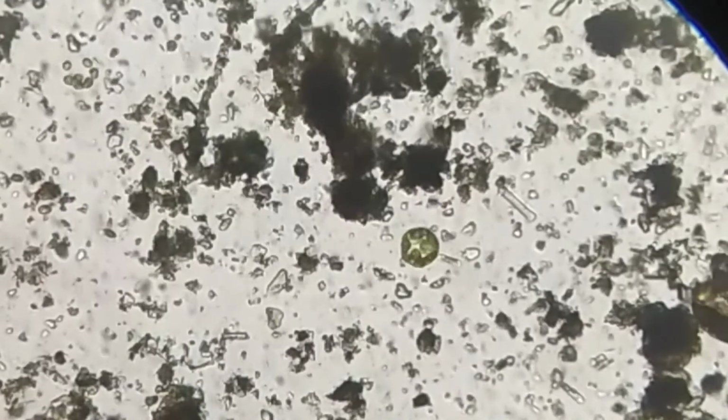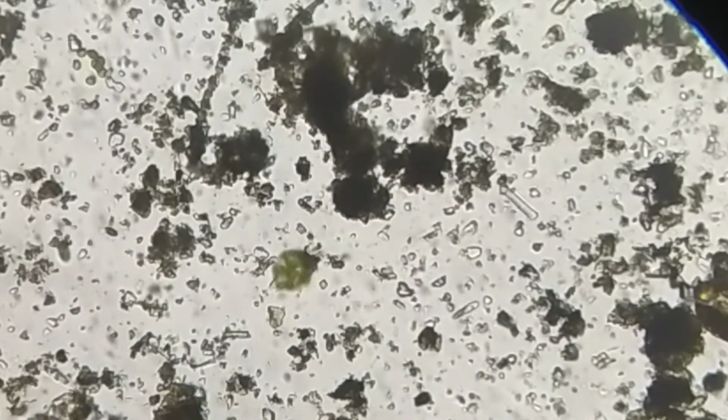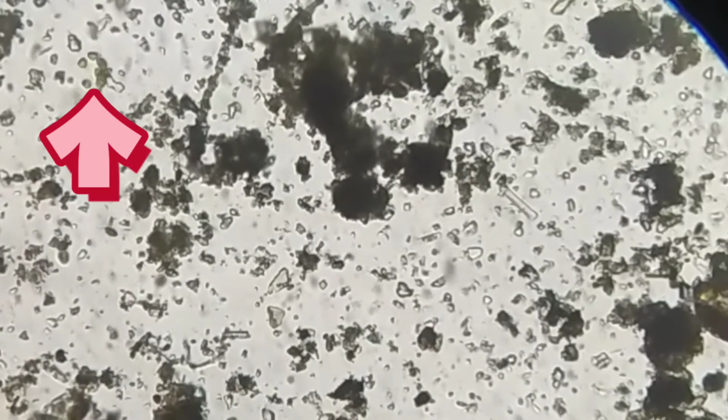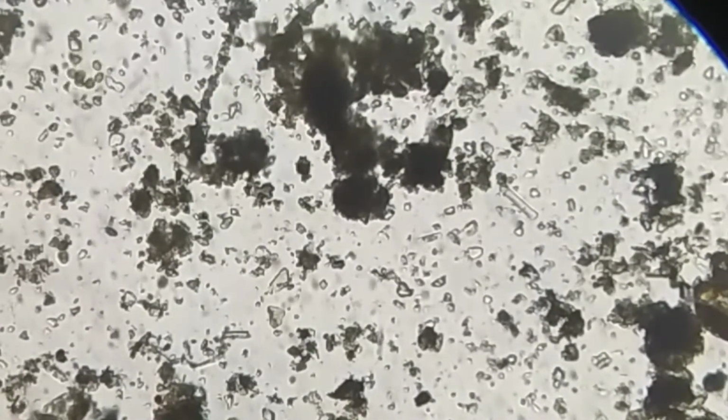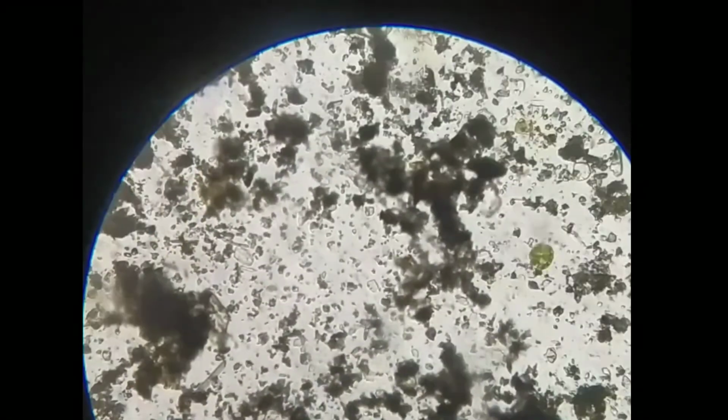So here comes our volvox. As you all can see, that novel coronavirus-like thing is actually a volvox. It's a green algae, and they move in circles like that, yes. That ball-like thing is formed by many algae. When many algae attach to each other, they form that ball-like thing, and they are usually found in colonies.